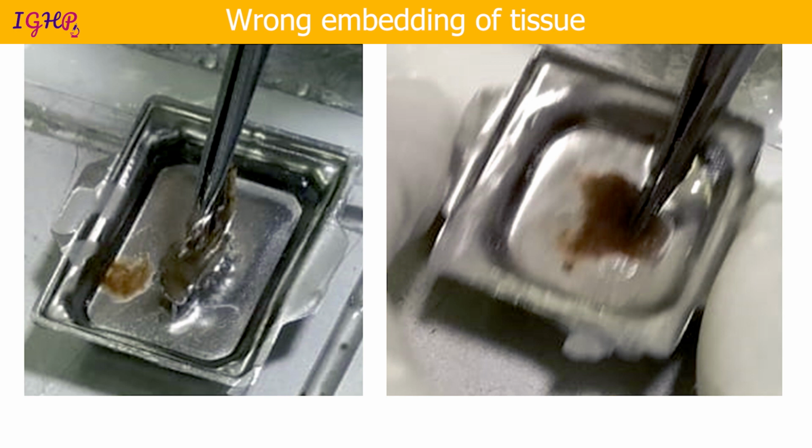So you should know how to embed those tissues, and therein you want the entire surface, that is the mucosa, muscularis. So they should never be embedded in a standing position. They should always be in a lying down position where you could see the mucosa, muscle and all the layers.